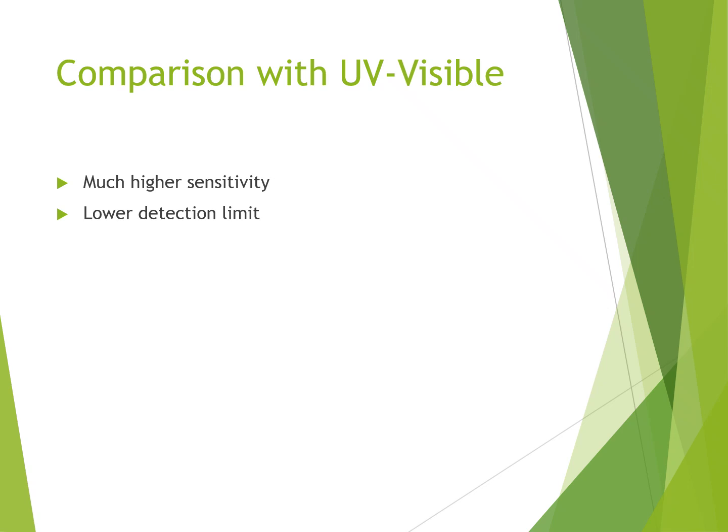If we compare it with UV visible spectroscopy, it is much more sensitive. It has higher sensitivity as it has a low detection limit. It has high sensitivity, because any technique that detects lower concentrations will have more sensitivity.